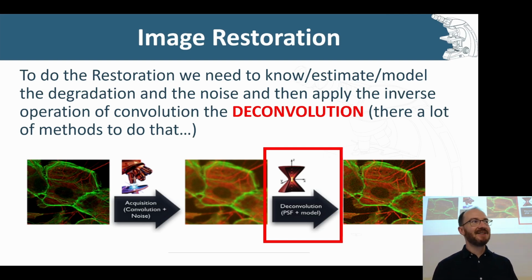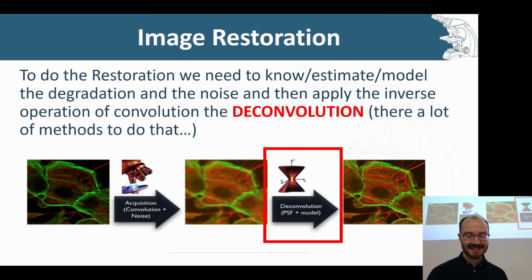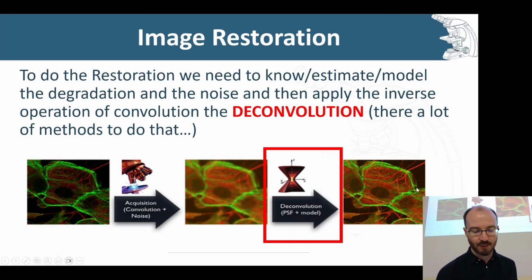I know it's not the case here, just due to historical decisions and understanding of things. But the reality is that you need to make sure that your images are deconvolved before you analyze them, because trying to get sense out of this is rubbish. Getting sense out of that, you actually get a little bit more concrete information.